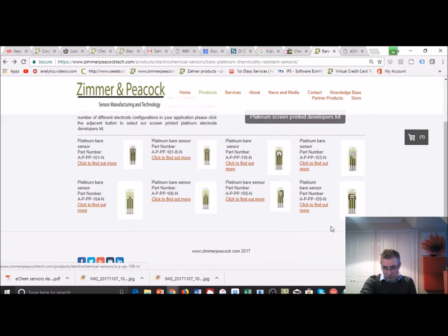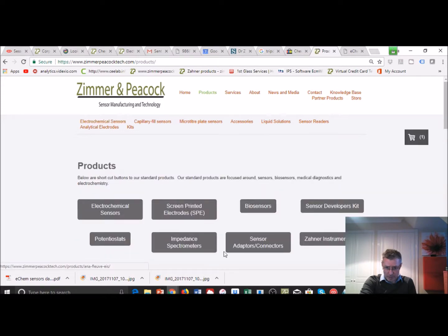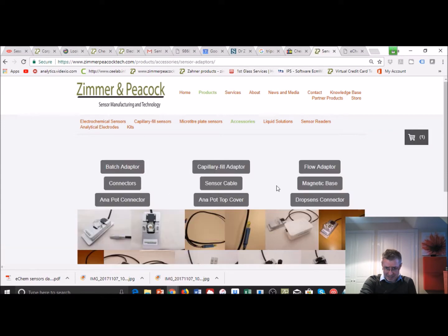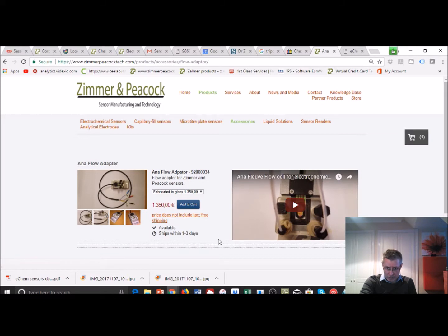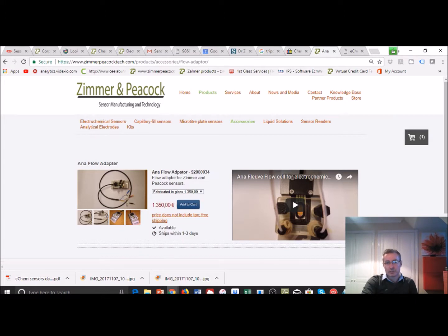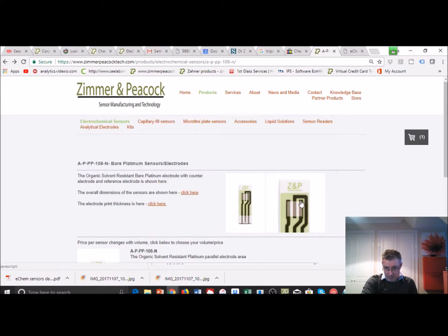Now, we also have these kind of parallel electrodes as well, so they'll do a similar job. I kind of like these because you can use these parallel electrodes in conjunction with one of our flow cells. I'll just show you accessories. There's a flow adapter, so I'll just show you, it's on this page. You can end up having electrodes that are in the flow stream or perpendicular to the flow stream, and I think that will give you different types of signals. Whether it enhances or reduces a signal, you have to try it out, is my suggestion. So I'll go backwards a bit and say, every time I show you a spiral electrode, there are these parallel electrode equivalents as well.